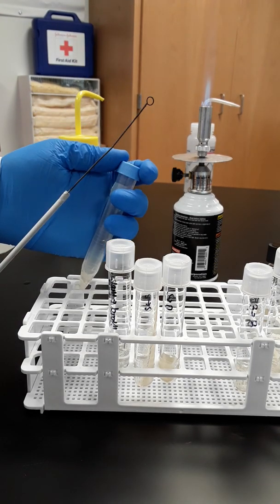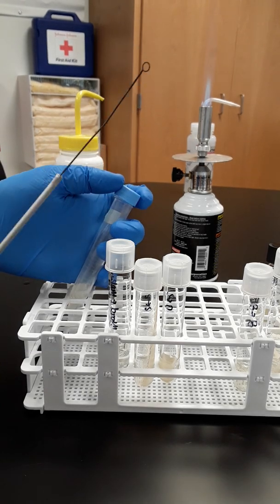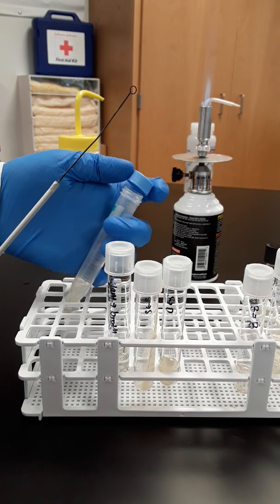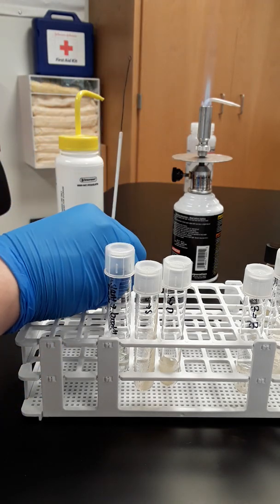So when you're ready to open, and remember the loop, we only want to touch sample to sample. We don't want to touch the sides. So you're going to unscrew with 2 fingers and pull the cap off. We want to be extra special careful. I'm just going to stick this here so it's not touching.